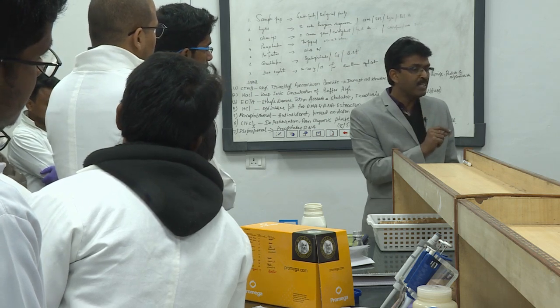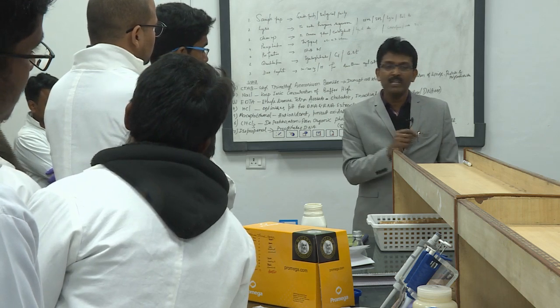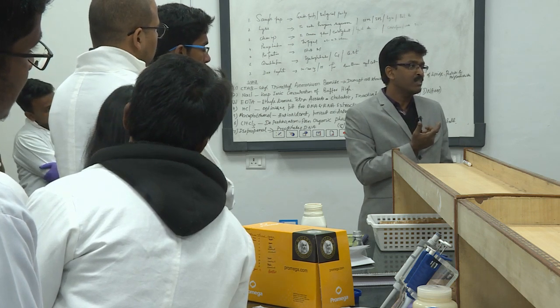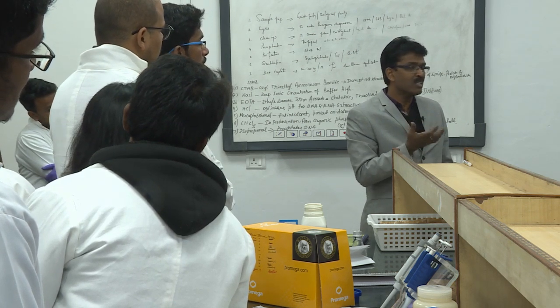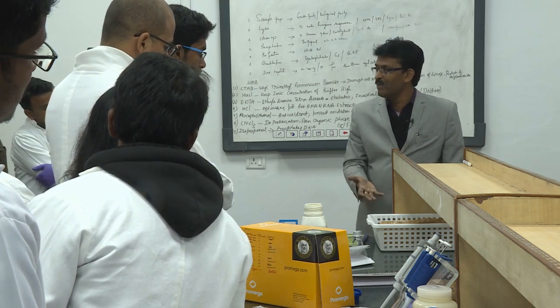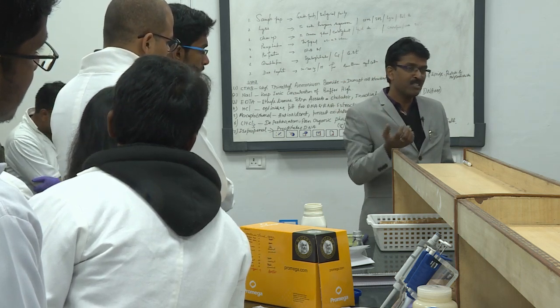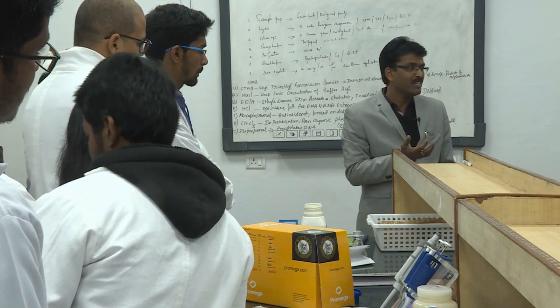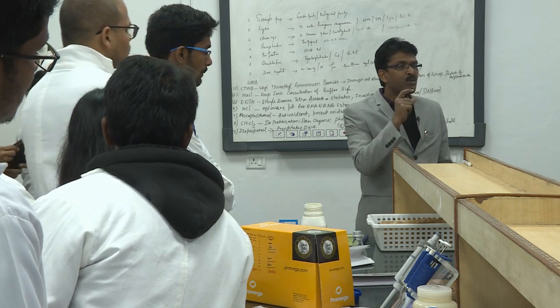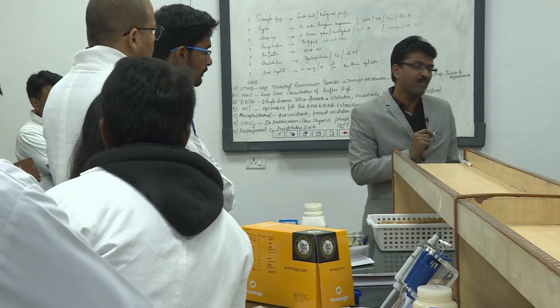Okay. Dissolve DNA completely, otherwise a density gradient forms, and you are taking 1 microliter out of 100 microliter of DNA stock, right. Definitely the chances of error are plenty here. If it is not dissolved, the heavy will be at the bottom and the light at the top, and you take not a true representative of the volume which is really needed for the experiments, because you believe the machine's data, right. So, it should be a homogeneous, completely dissolved DNA. Without that, I do not think you can perform any experiments.